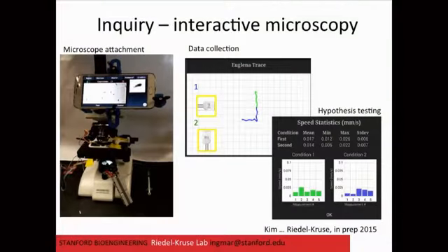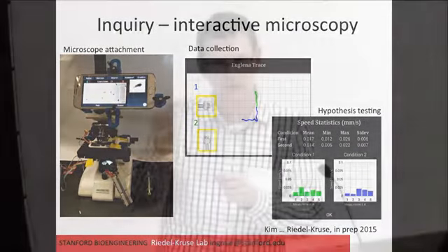So I think the question of cells dying, maybe adults worry more than children. So we had a number of teachers actually coming to our lab, and we showed them and interviewed them about what they found valuable and what not. Some of the things the teachers really found very valuable is already just having a screen where multiple people could look at it, or just pointing at a cell and tracing it. Some teachers were less excited about the game aspect. Some teachers feel games are very good for learning, others feel it's not there yet, right?